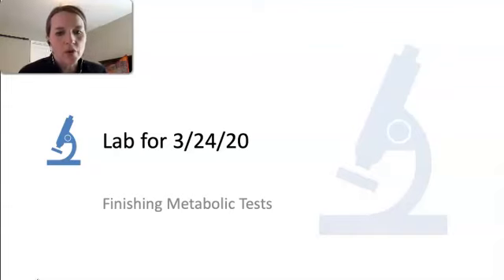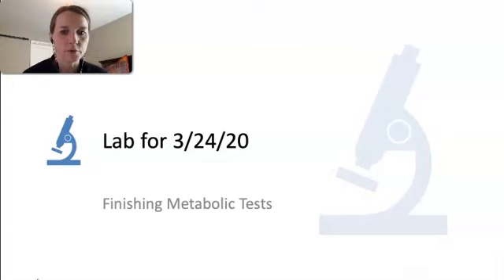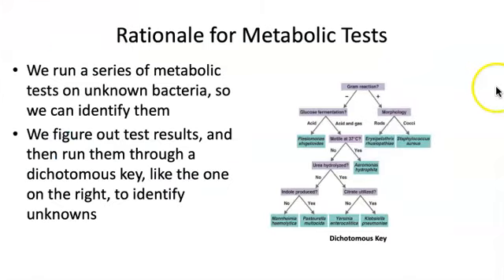Today we're going to be going over the rest of the metabolic tests that we hadn't finished yet in class. So I'm going to walk you through those, show you what we're testing for, fill out our charts, and then show you what the results look like when we're finished.